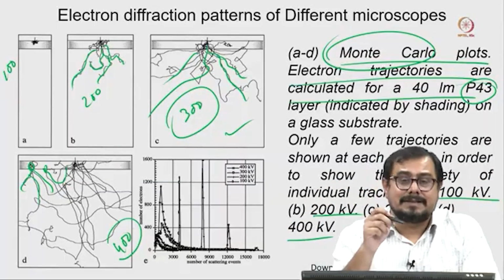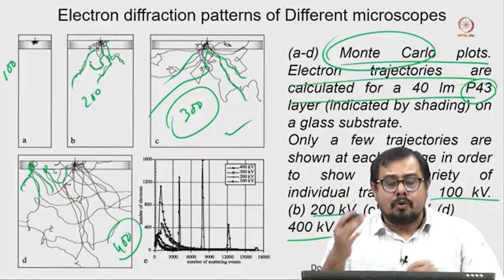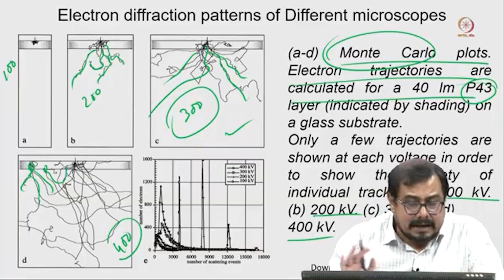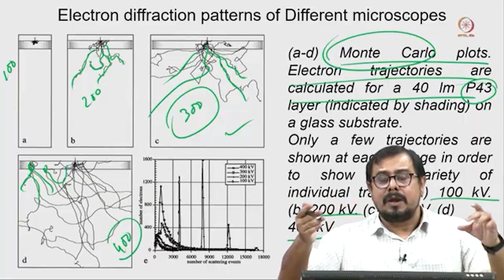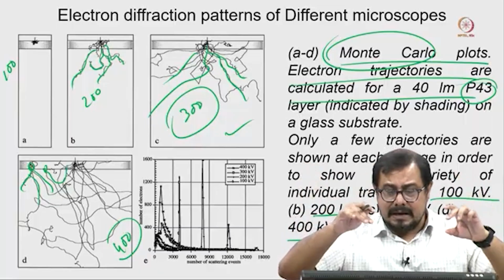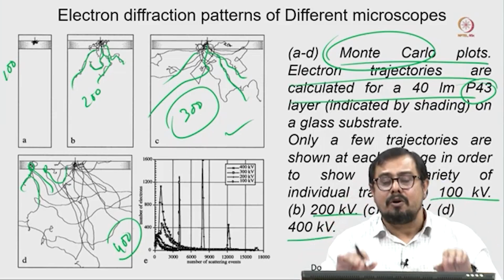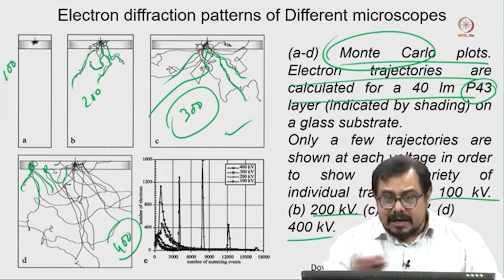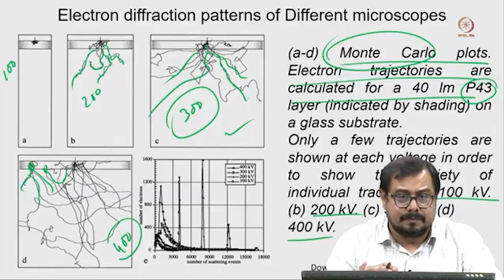That is why fast readout is very important, which is not possible with a CCD camera. It is only possible if we directly collect the electron, which hits the scintillator, and record that signal immediately. Then the readout will be fast and we can correct any kind of motion.